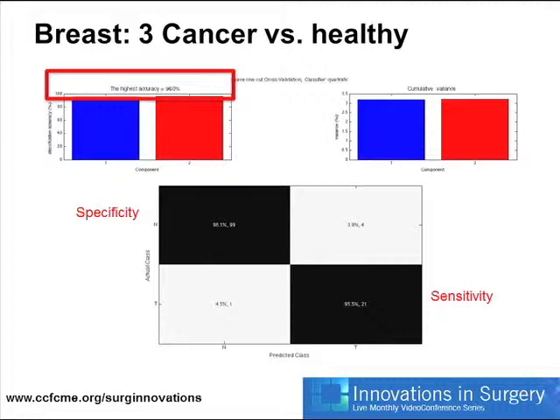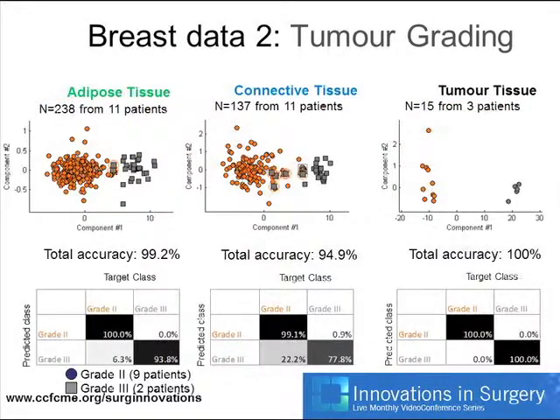In basic terminology, what we end up with is a confusion matrix, brilliantly entitled, I felt, because it can be quite confusing. But essentially, next slide, you get an overall accuracy score, and you get an assessment of the true positive, true negative, next slide, and false positive and false negative discovery rate of each individual patient as you go through it. Next slide.